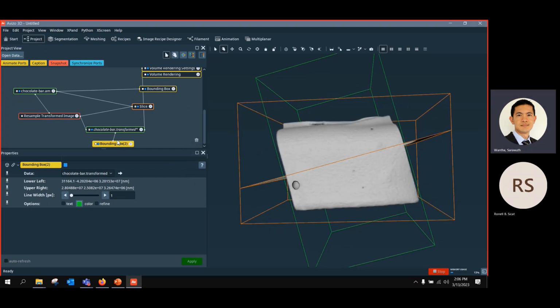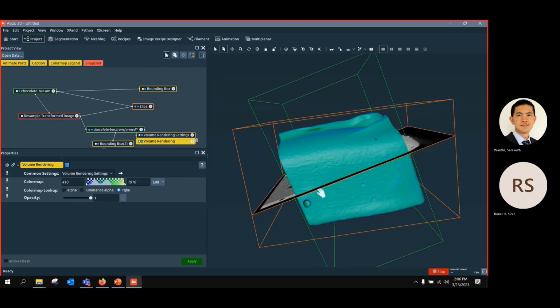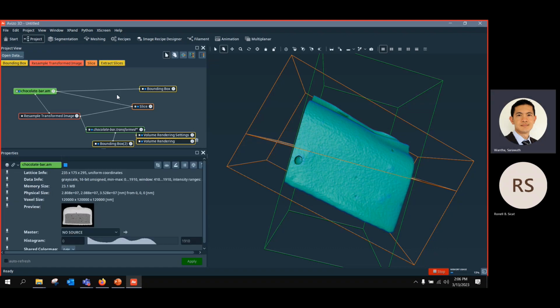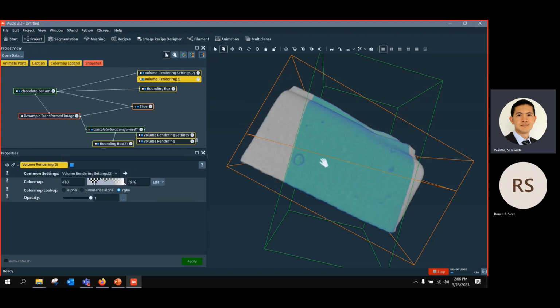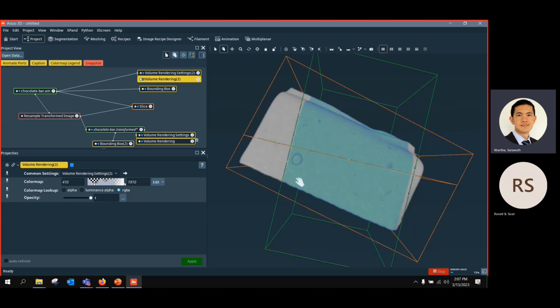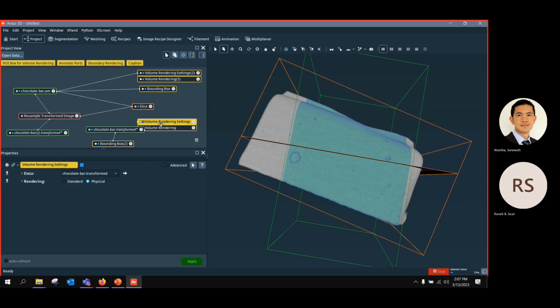So you can see that now it is the green one, let's say. So this is the new object. You can see that it aligned based on the slice, because before it was here, but the volume rendering again. Before it was aligned to the orange object, orange bounding box like this, remember? And now when you set the new slice, the way it aligns is aligned to the green bounding box. And if you change from crop to extended, it's going to look like this one.